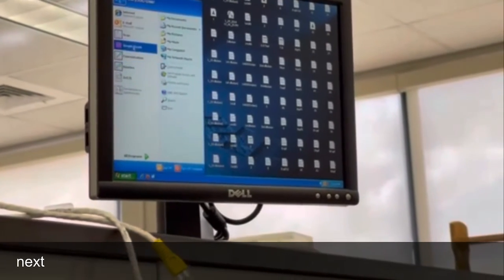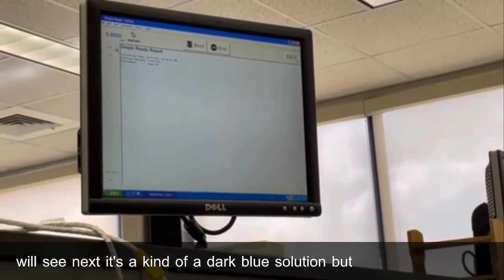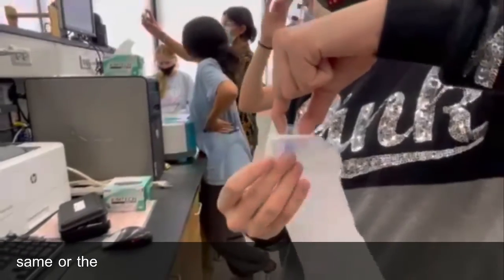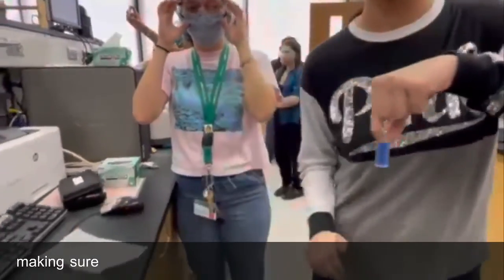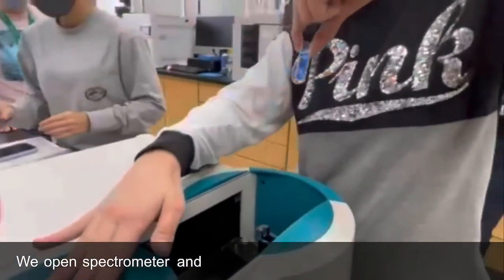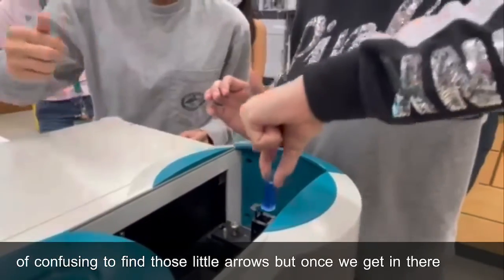Next, we're getting ready to put our stock solution in here, which you will see. It's a dark blue solution, and we will run that about 3 times and get the average for it, and then repeat for the following dilutions. And as you can see again, we make sure that we clean the cuvette really well. We open the spectrometer lid and put it in very delicately, which can be confusing because of finding those little arrows, but once we get it in there, it's good to go.